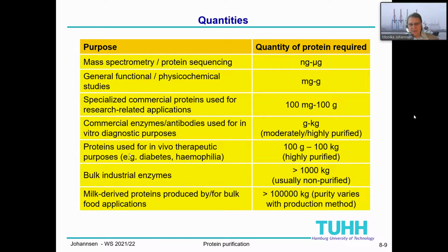If we have proteins for in vivo therapeutic use, like for diabetes, for example, then we have highly purified proteins and scale up to 100 kilograms.